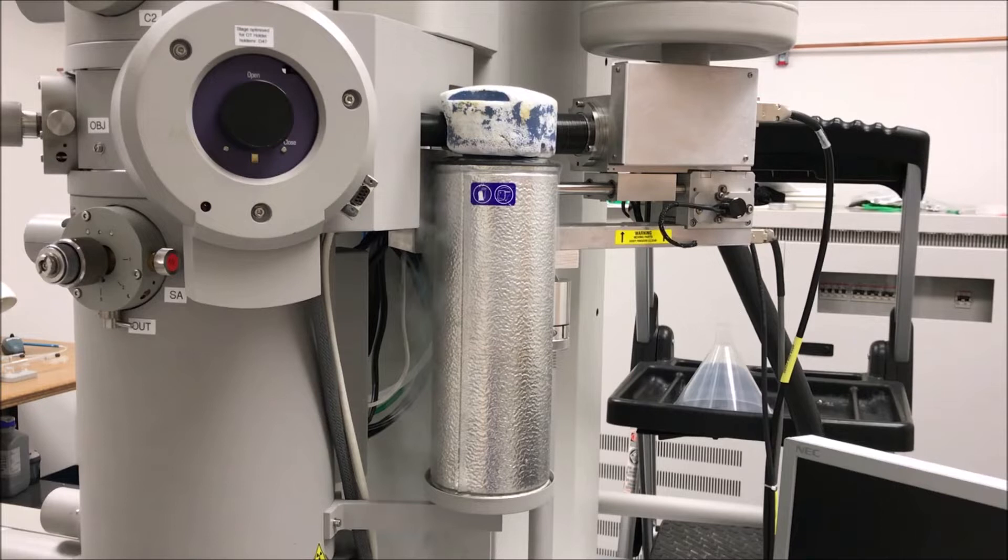On some instruments this is called an anti-contamination device. They all function the same way. It provides a surface for contaminants to stick to so they don't get on your sample, and it also keeps the pressure in your column down. What it does not do - and there's actually a YouTube video that incorrectly states this - the cold trap does not keep your specimen cold. It has nothing to do with specimen temperature. The only way to control specimen temperature is with a specialized holder.